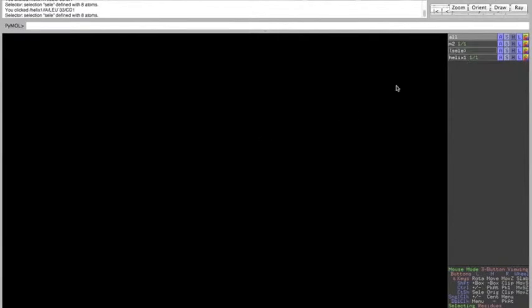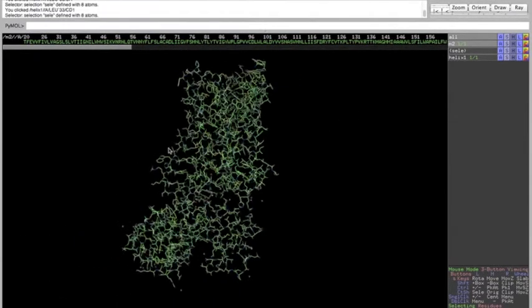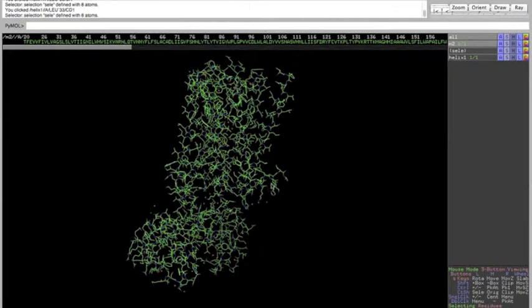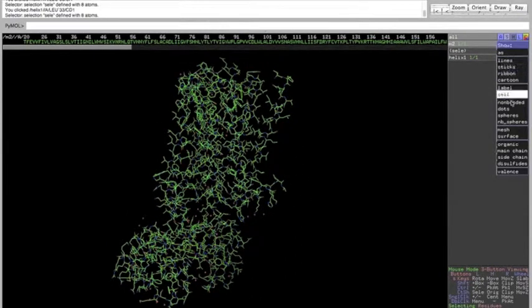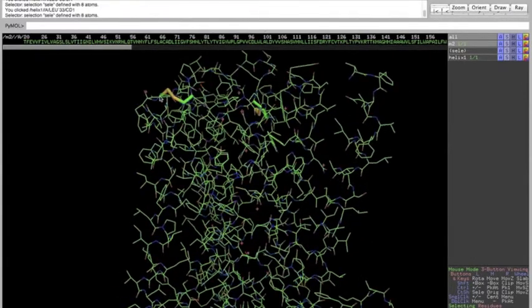Other useful functions within Show: if I go back to viewing the M2 structure, so I'm going to deselect helix 1, go back to M2, you'll note that we lost that cartoon view because that was only for the other object. Under the Show tab, I can look for disulfide bonds within my molecule, and this is pretty subtle, but you can see one that was just shown up here in stick representation with a little bit of yellow color. So the yellow color is now representing sulfur atoms.